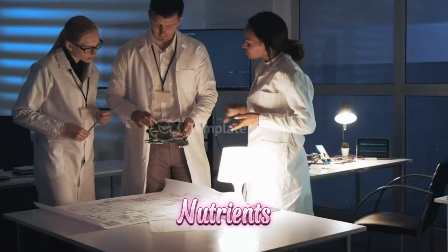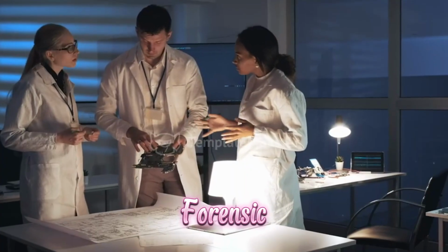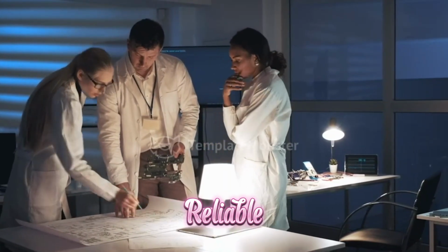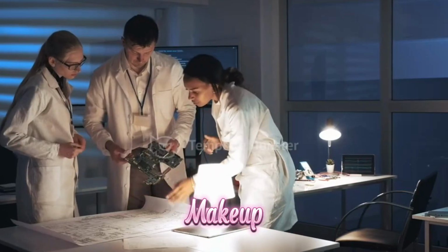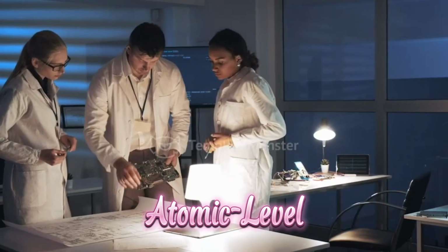So, from checking the nutrients in our food and soil, to environmental monitoring, and even in forensic science, Flame Atomic Spectroscopy is a powerful and reliable tool that helps us understand the chemical makeup of the world around us. It's a bit like giving scientists atomic-level vision.